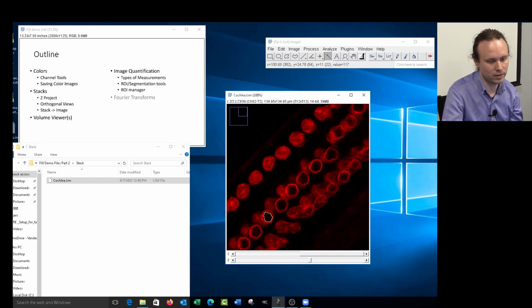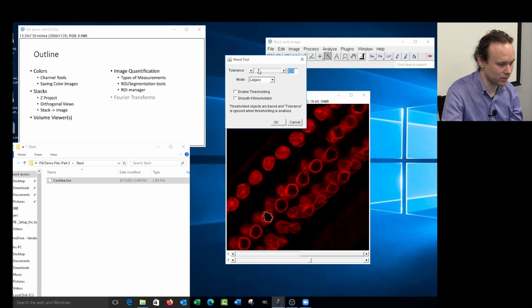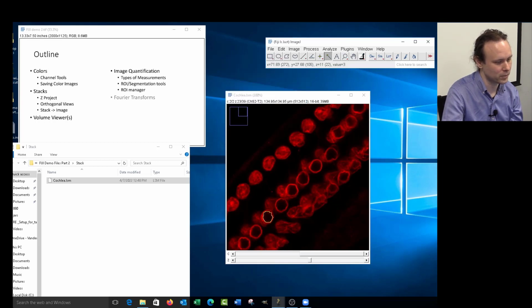So this is very dependent on your brightness being consistent. And it can pick bright things or dark things. It doesn't matter, but there has to be a boundary. If we set it too large, which I will attempt to do, it will probably travel out to the outer sides of the sample. So this is basically selecting the whole sample. So if you find you're using this tool and you just can't figure out what's going on, reduce this value and see if it gets back to small again.